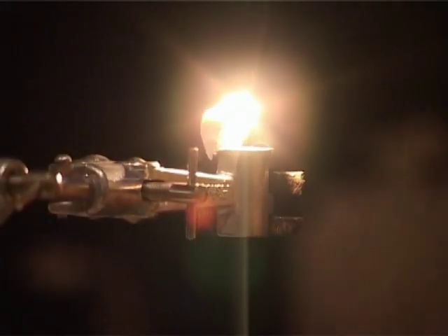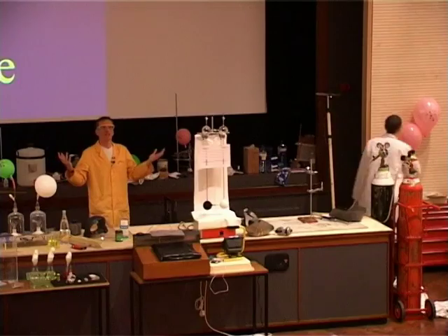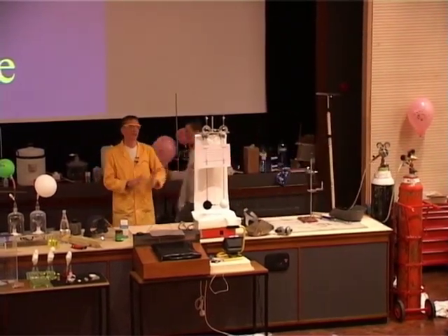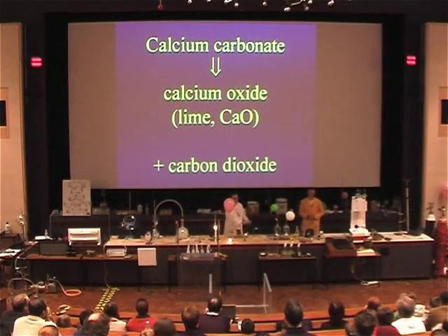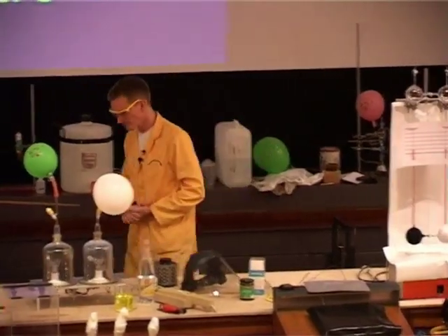Now, this light source was used in early theatres. So when they wanted a spotlight on somebody, how did they get their bright light? Well, there weren't any batteries and light bulbs at the time, so they used this chemical light from the lime, and hence it was called limelight. We still have this expression now, in the limelight, and this is how it was generated.